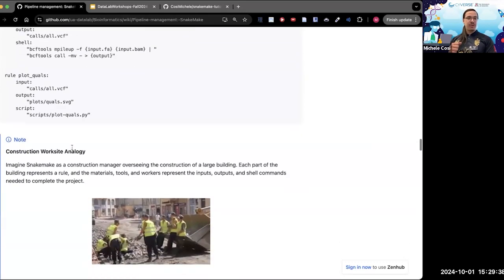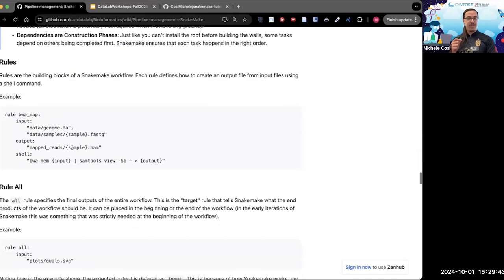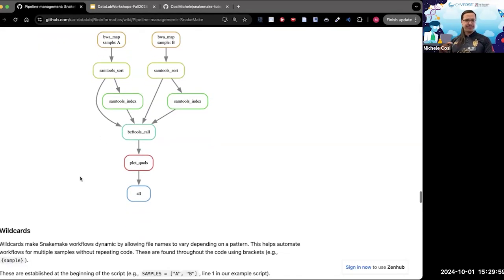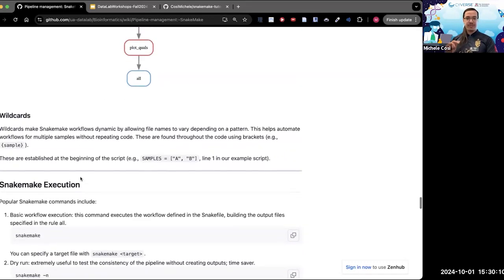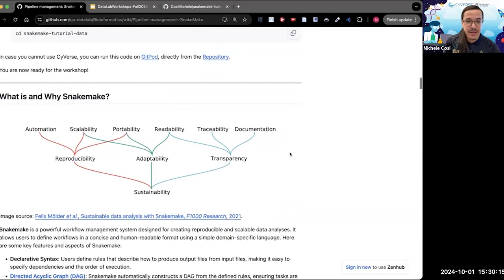I'm not going to go through all of it right here because I'm going to be asking you to run it yourself. For this small exercise, we will require a GitHub account. And if you do not have one, that's okay. This is replicable at any point in the future. But you have to create a GitHub account first. So before we talk about execution, I'm going to scroll all the way up and I'm going to paste in the chat where you have to go.